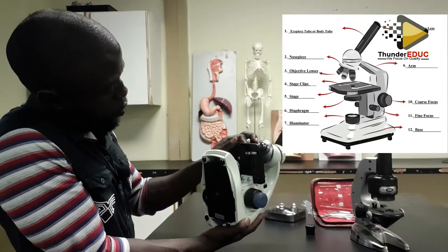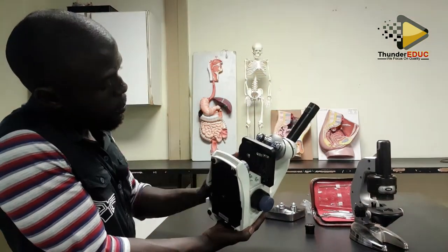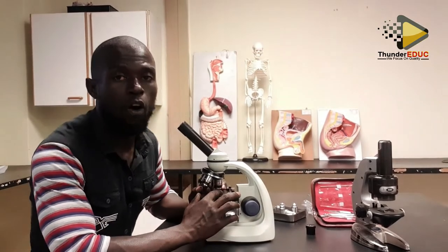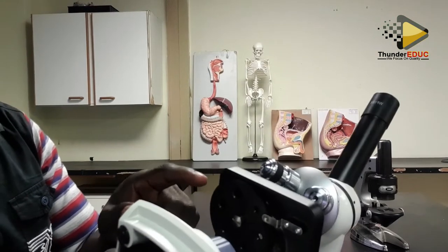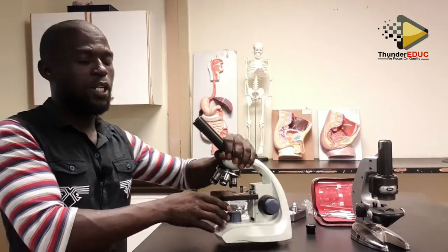It has different holes. These holes allow light to enter. But it has this part that we turn. If you have a thick object, you use the small hole. Looking at them, there are some which are big and some which are small. You use the smallest if the object you're trying to view is a bit thick, so that the small hole brings about a sharp light. It enters and penetrates this thick substance, and then you are able to see it here.